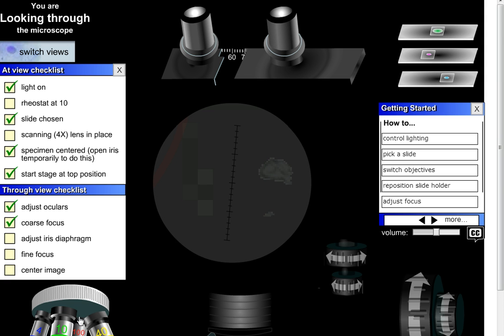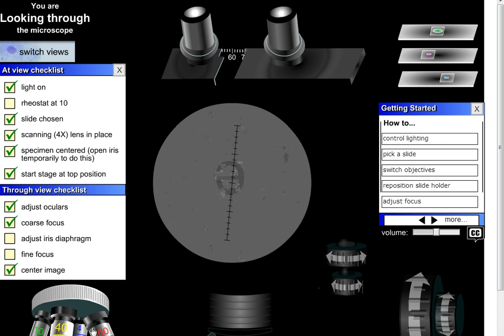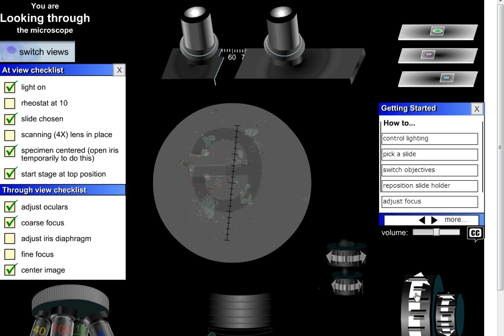All right, so now I shall move, if I can do it right. No, I went to 100. Sorry, I went the wrong way. To the 10. And you'll see it's bigger. I need to adjust a few things. First, it's okay in the center. It could be a little better, but it's all right.